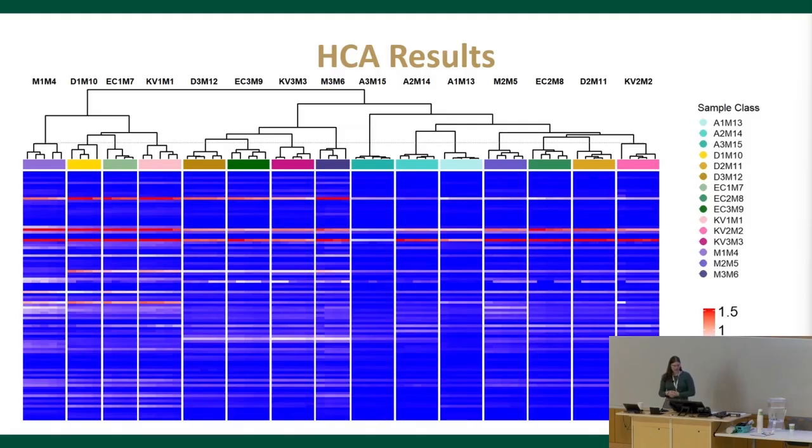Looking at the HCA results, this HCA was combined with a heat map analysis, where every row represents an analyte and the color represents the relative abundance of that analyte, with red being most abundant and dark blue being absent. The first grouping we saw here was on the far left. It's the groups of mead brewed with 1.5 pounds per gallon of honey. And here we can see that D47, EC1118, and Kveik-Voss are all tightly clustering, while Munich moderately clusters with the other three strains, which is exactly what we were seeing in our PCA and PCoA plots. So that's cool.